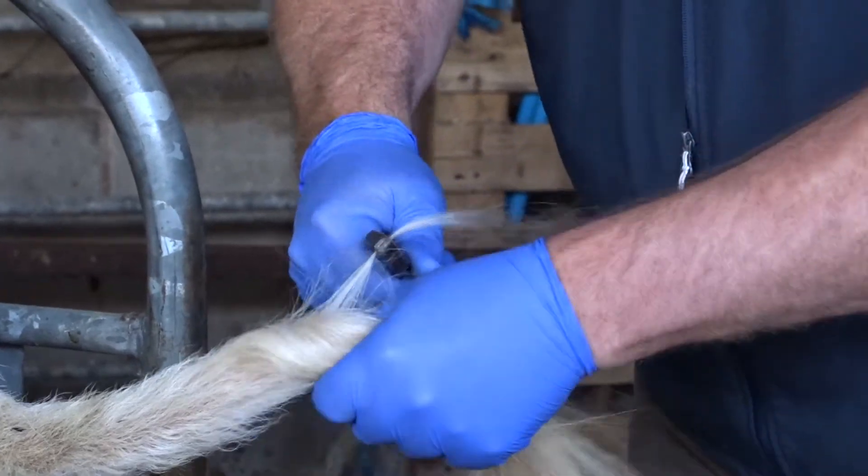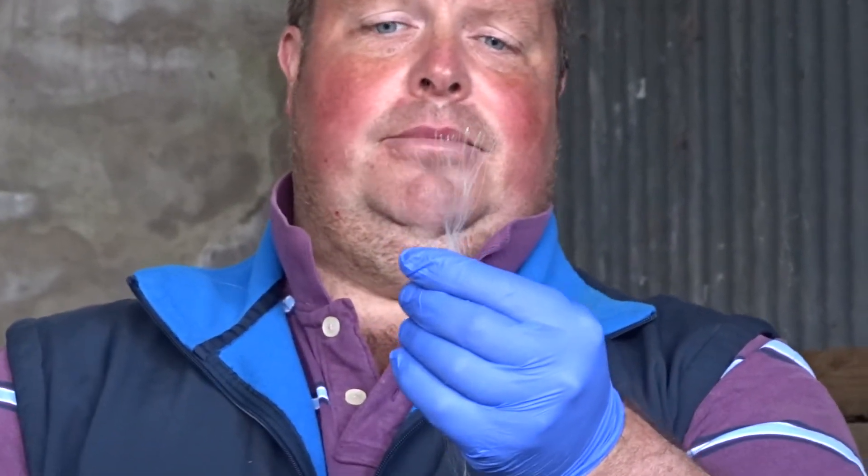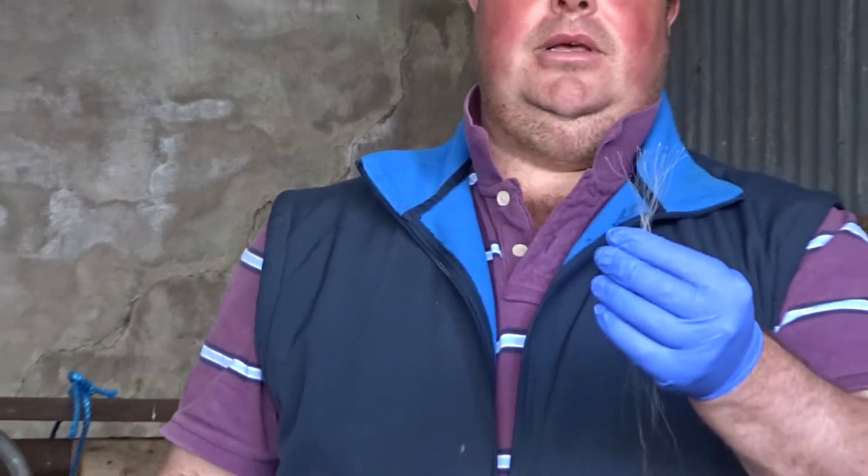Basically you grab it like so and pull. Again, you have your roots here. I don't have to put this into the bag because this is a repeat sample. Hopefully this has been of some help to you. Thank you very much.